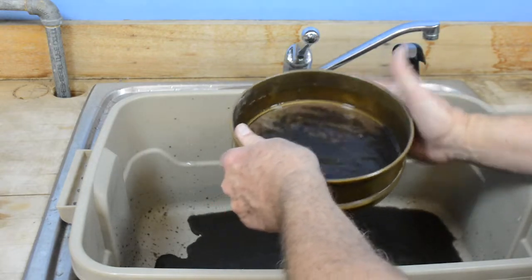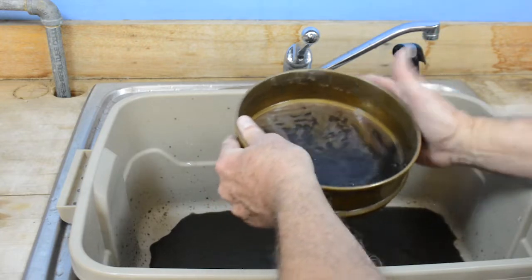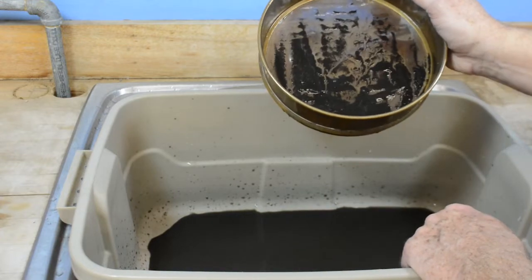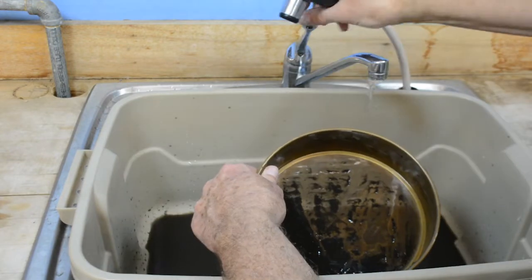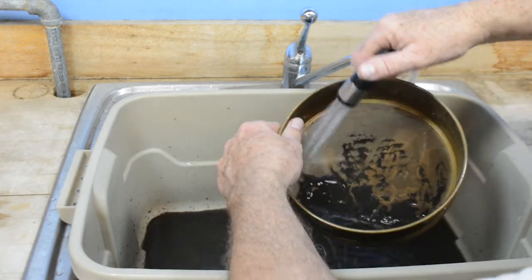What remains is fine sand, silt, and organic matter, like small roots, nematodes, and VA — vesicular or buscular mycorrhizal spores. Next, I'm going to wash this down and concentrate the material in one part of the sieve.